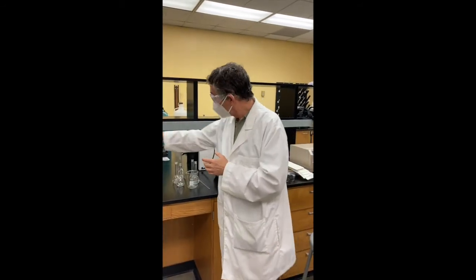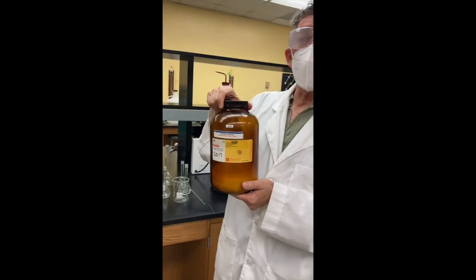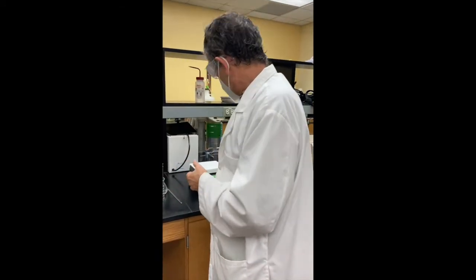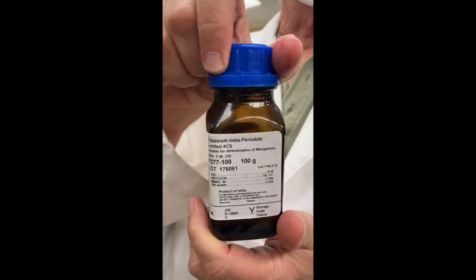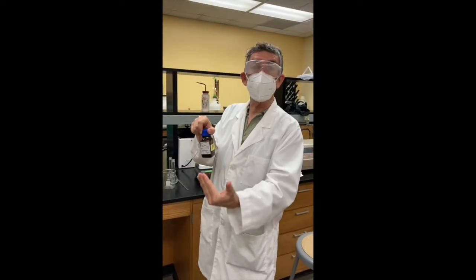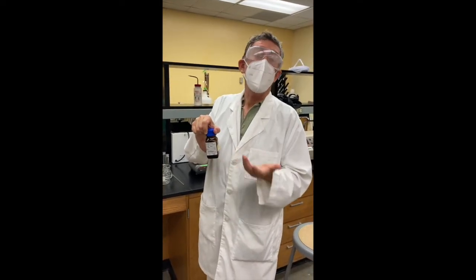So we're going to make a solution of polyvinyl alcohol. We will then take part of that solution and cleave it, oxidative cleavage, with potassium periodate. And then each of those solutions, cleaved and uncleaved, we will make dilutions of. So we have two concentrations of the cleaved, two concentrations of the uncleaved, and we'll measure our viscosities.